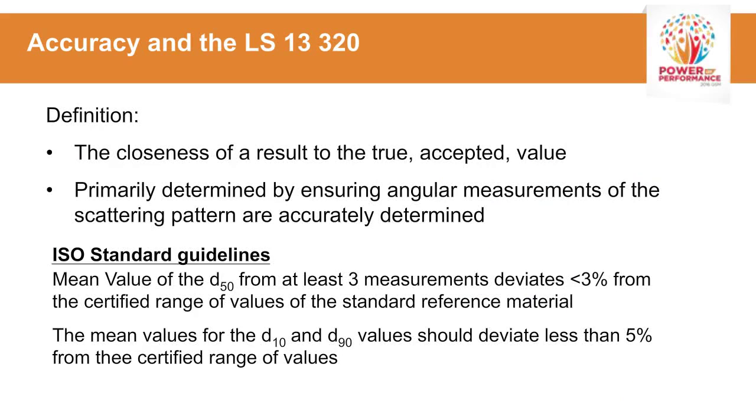In discussing accuracy, and I'll show some results in a moment, accuracy is defined as the closeness of a result to a true accepted value. So you're going to be running controls or standards, and I'll show one in a moment.